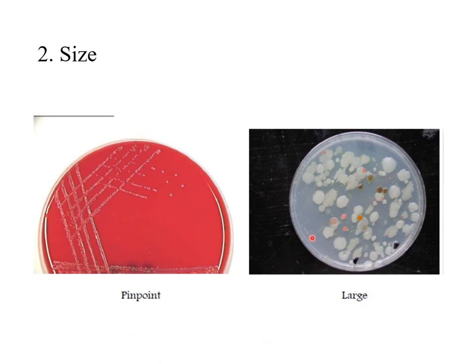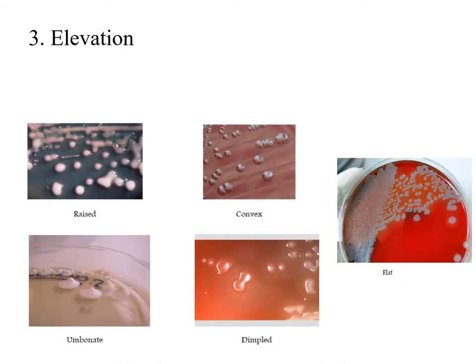In this plate, we can see different colors and sizes of colonies. The elevation of a bacterial colony may be raised, convex, flat, dimpled from the middle, or umbonate with an elevation in the middle of the colony.